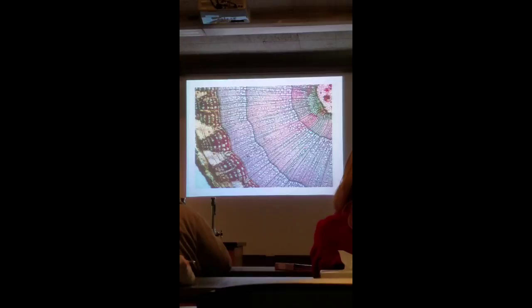All right, so this region, this is all, what is this kind of tissue, complex tissue here? Xylem, okay. The larger cells make up what kind of wood? Spring wood, and the smaller? Okay. What layer might we find right here? Cambium.